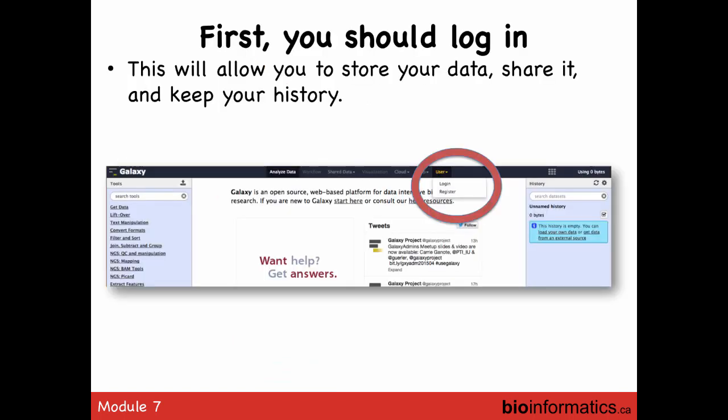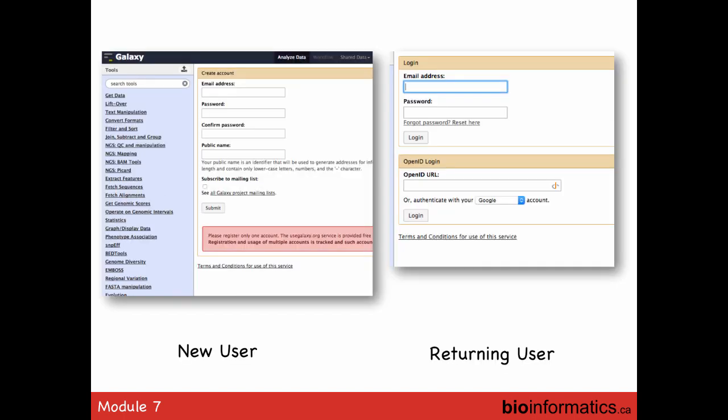In this RNA-seq example, we have paired-end reads — one set from adrenal gland, the other from brain. The first thing you want to do is get data, which is the first item on the left panel. You basically copy a URL — one of the ways to get data into Galaxy.